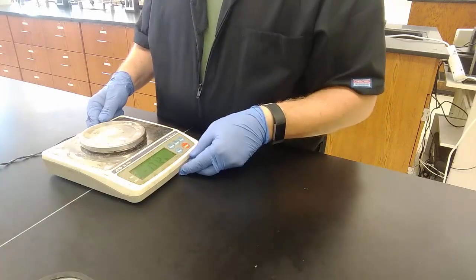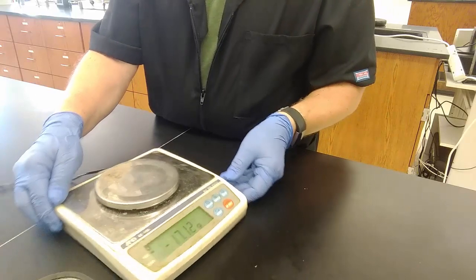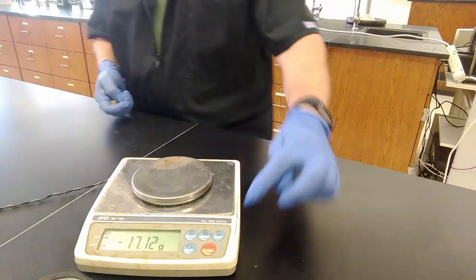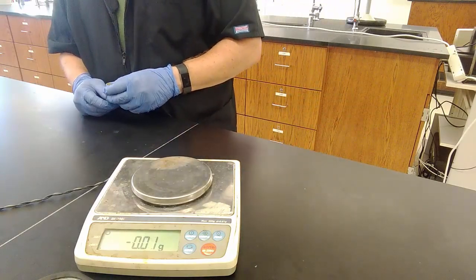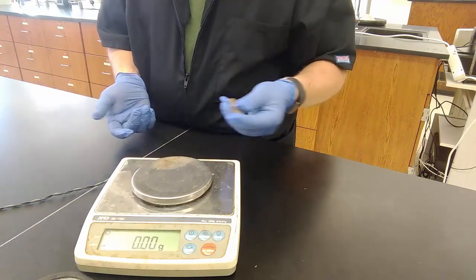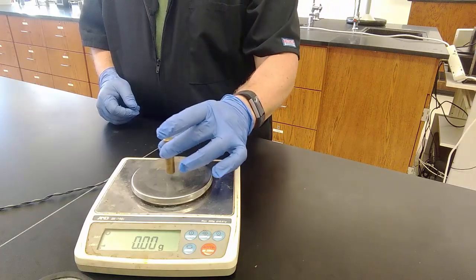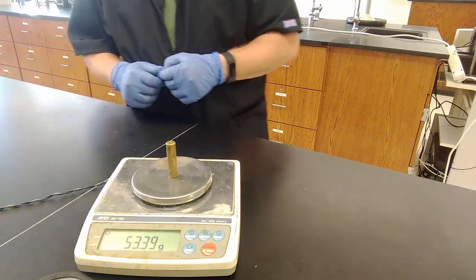Let's see if I can. You should never move a balance, but I'll move it closer where the numbers are a little bit visible to you folks. Okay? So I'm going to weigh my metal bar after I zero the balance. I'm going to weigh my metal bar. And when I say weigh, I mean obtain the mass. It's just awkward to say obtain the mass every time. So I mean obtain the mass, but I'm going to say weigh. Weigh the metal bar and record its exact mass on the data sheet on line 1B.